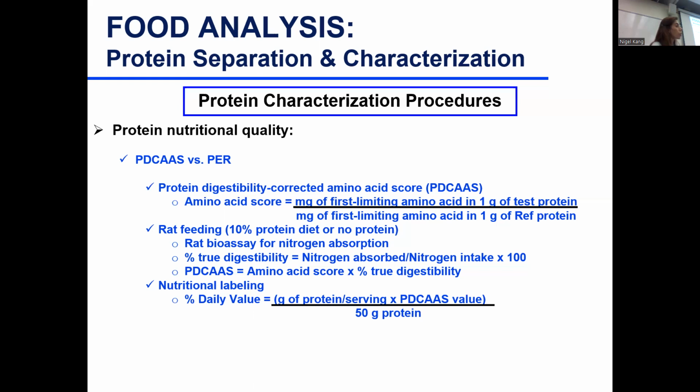In the in vitro approach, we use different acidic reagents to mimic our digestion system in the lab. So we don't use rats. It needs less work, and we don't need that 28 day time frame. It can be done in about 2 days.